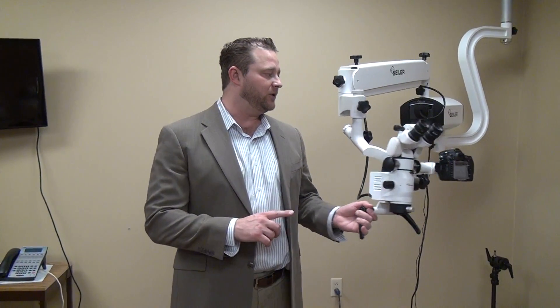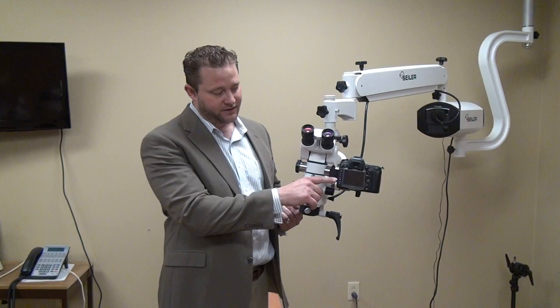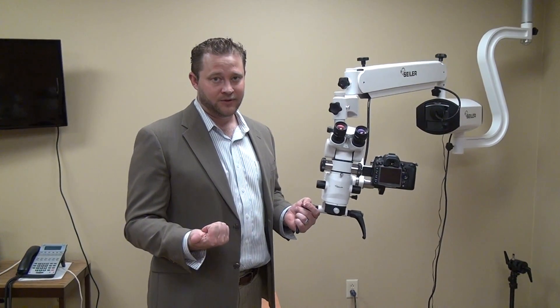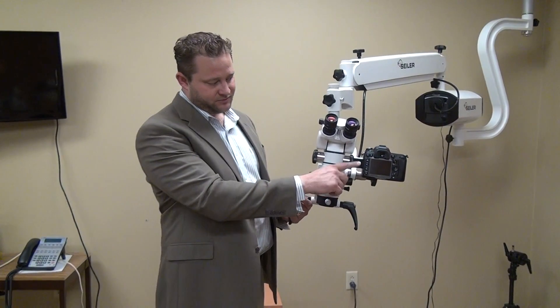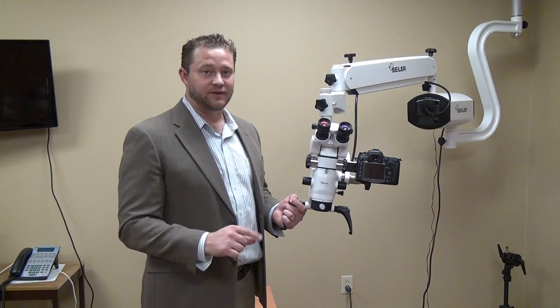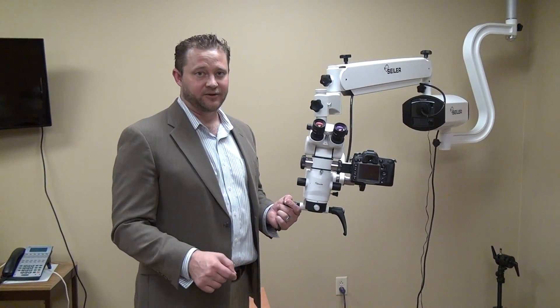The downfall with running live video all day, every day, is make sure that you have a backup battery or you get some sort of power adapter so you can continuously run the camera all day without switching batteries.